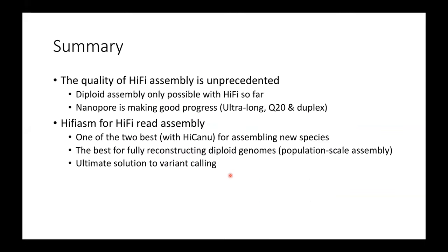So I will summarize here. I think the quality of the HiFi assembly is unprecedented. I don't think anyone has ever achieved that before. You may have heard about the human telomere to telomere project, and HiFi is the main data source. Although they are using other data types, and nanopore is still very helpful, they built the initial assembly with HiFi. Without HiFi, they wouldn't have been able to do that.